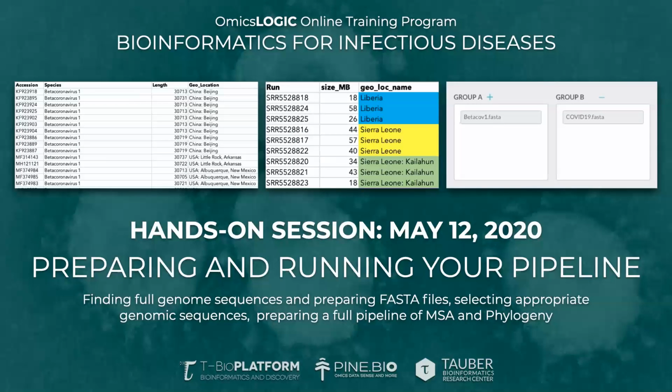If you have some questions and you want to follow a step-by-step tutorial, first of all, you will be able to review this recording and do the same steps. The second one is what I recommended last time, to really start from what we did last time, which is mapping reads onto the reference genome, and that is covered in that SF9 project.